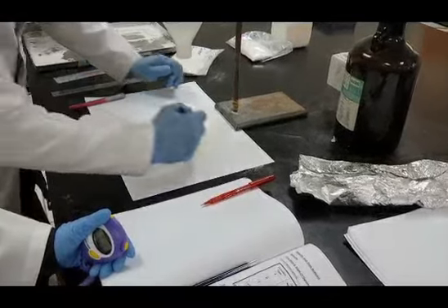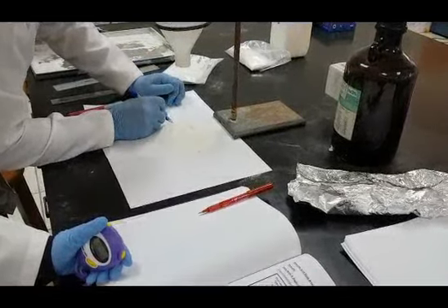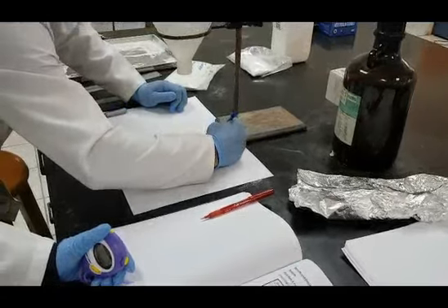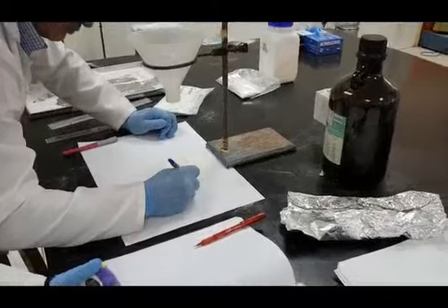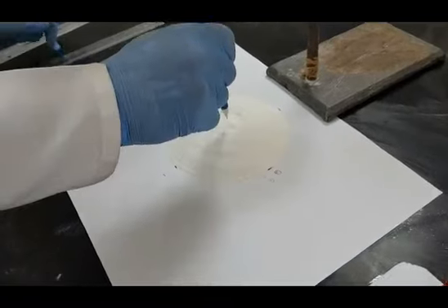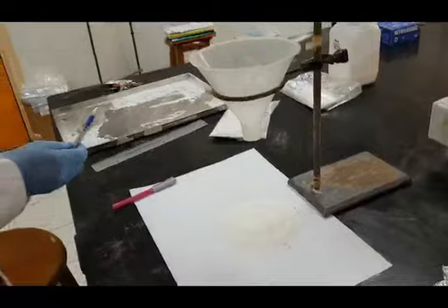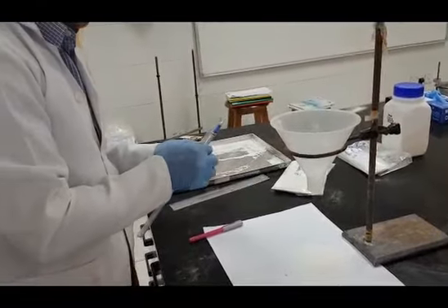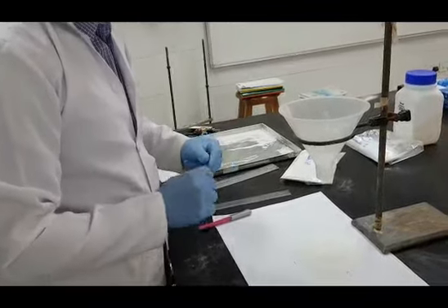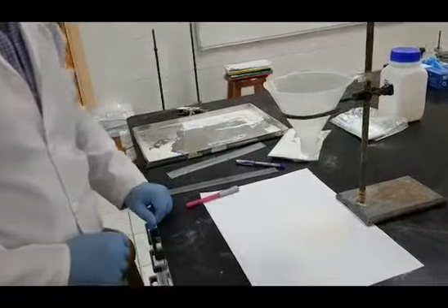Here you will record the time required for 100 grams of granules to flow, and the height of the piles formed upon flow under the effect of gravity, and the diameters. The time will be used to calculate the flow rate, and the diameters and the height will be used to calculate the angle of repose.